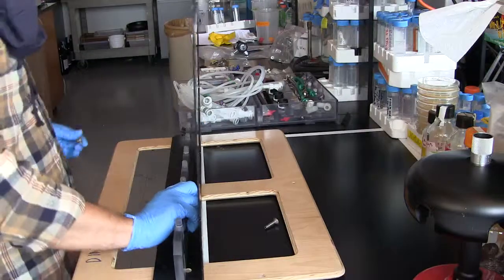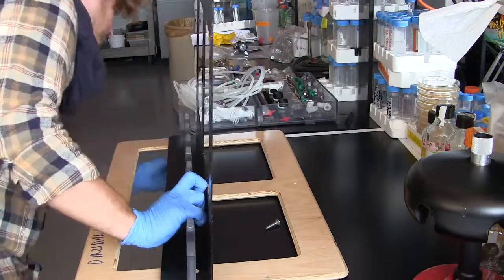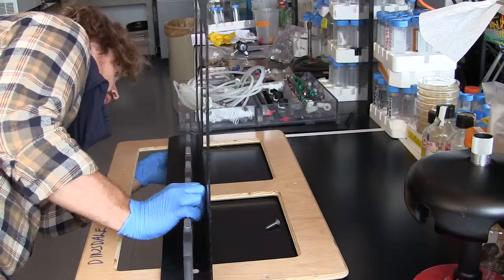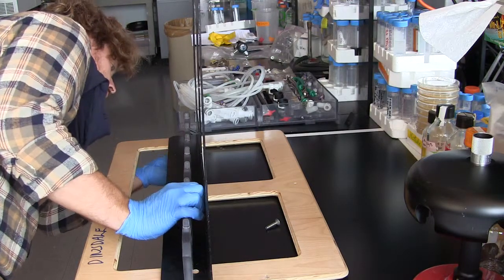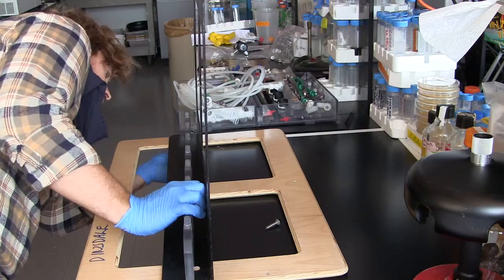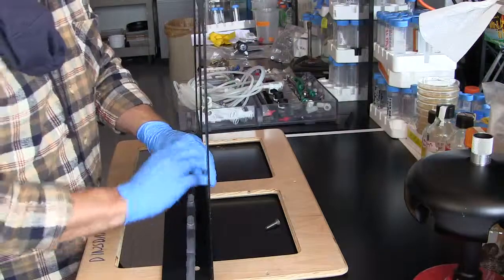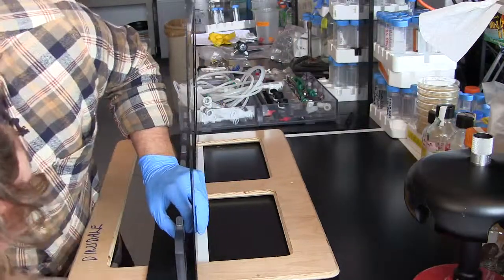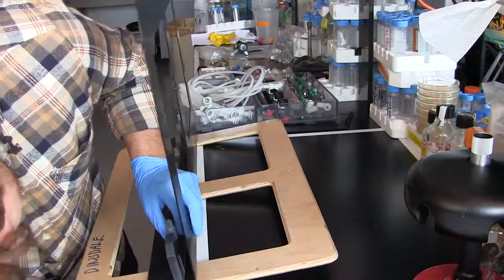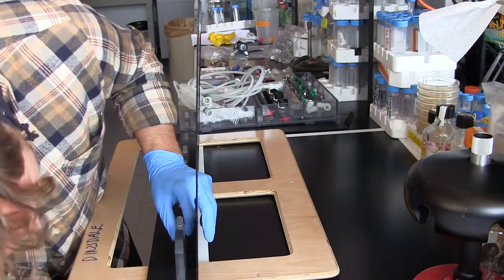Next, once you've got one in, go along to another, line it all up again, and go again. Now obviously, because of degrees of freedom, by the time you get to the last one it should be really, really easy. Let's see. Goes up through here into the plastic piece. Screw it in nice and easy like that.